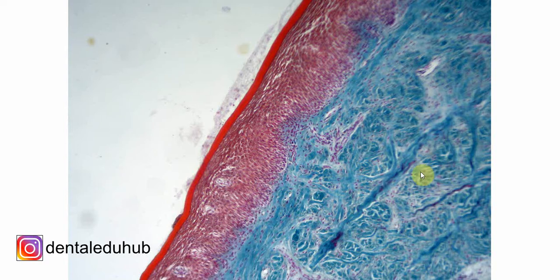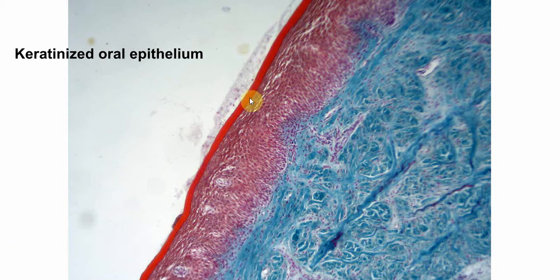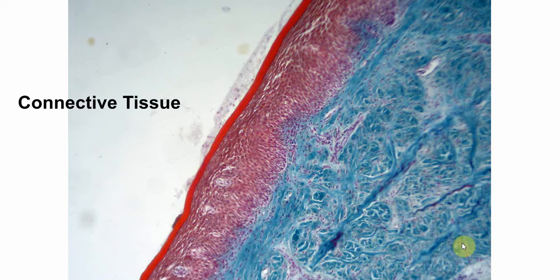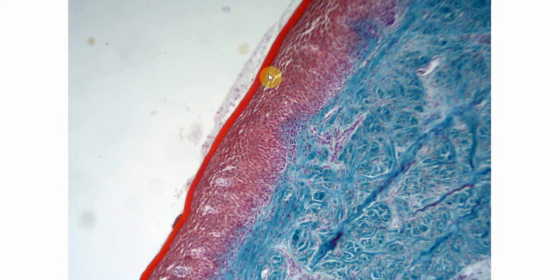This is keratinized oral epithelium. This is the epithelium and this part is the connective tissue part. This is a low magnification image and this is not an H&E staining — it is some other staining. But this is a keratinized epithelium and this part is the connective tissue part.